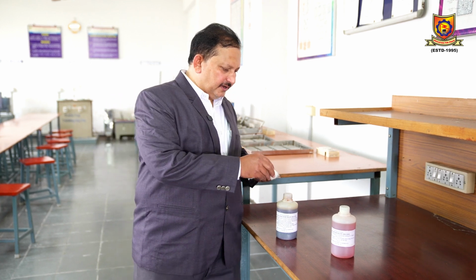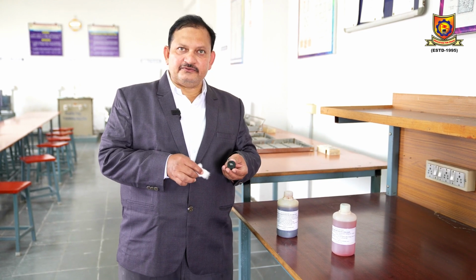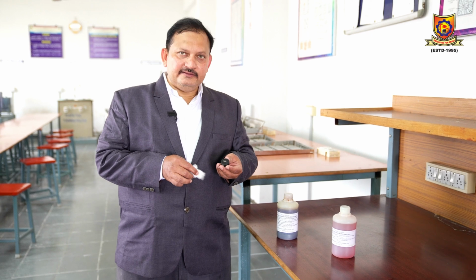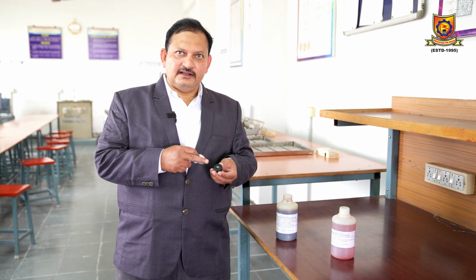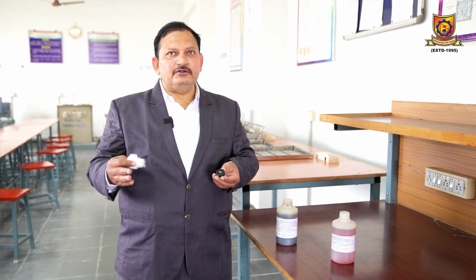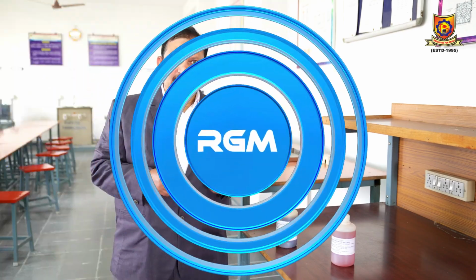Once you apply this nital on the surface of a polished specimen, this chemical agent reacts with the phases present in the microstructure, and it will give a contrast, a different color compared to its neighboring crystal or neighboring phase, so that we can easily differentiate the different phases present within that microstructure.